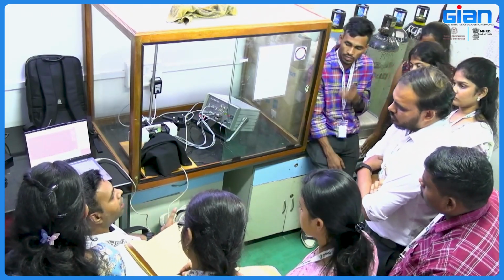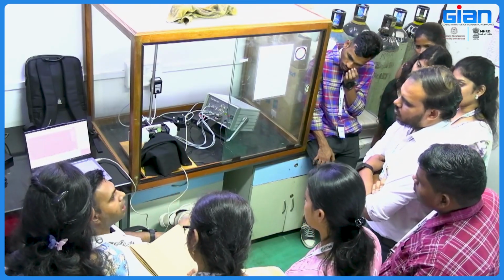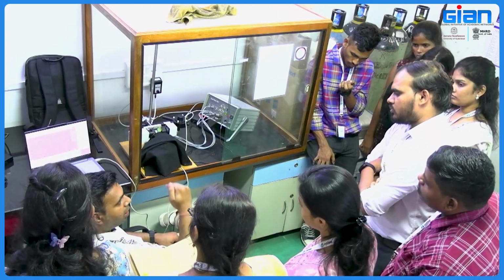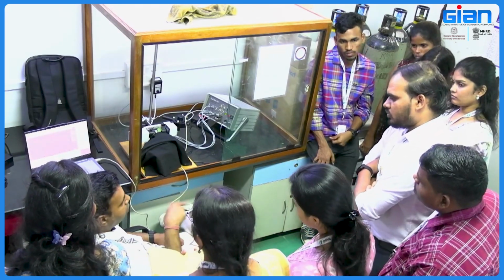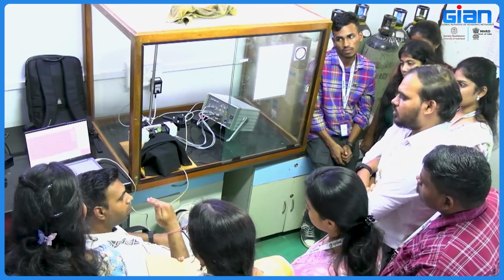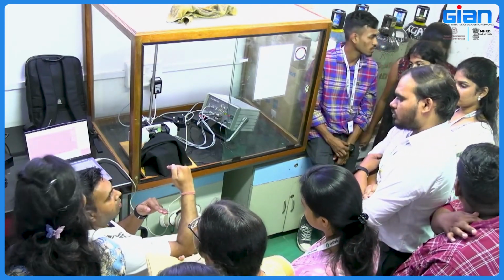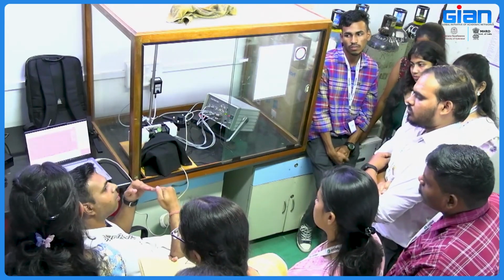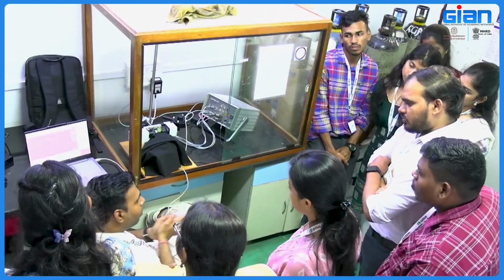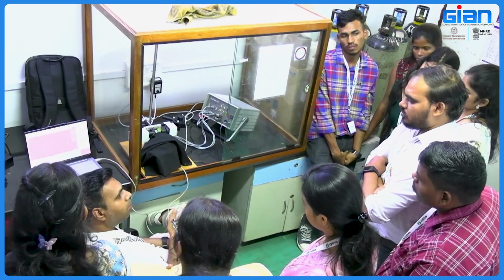If YNO is not higher, YNPQ should be higher. YNPQ is higher means the plant is efficiently dissipating the energy. Got it? So under too much stress, if the plant is not able to dissipate that energy through YNPQ, if the YNPQ apparatus itself is already damaged, that energy has to be taken over by YNO. So YNO will increase, and because of that, YNPQ will drop. So just by looking at YNO and YNPQ, you cannot tell whether it is under stress or not. You have to check with Y2, YNPQ and YNO.